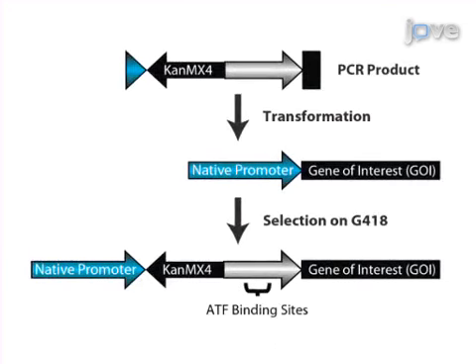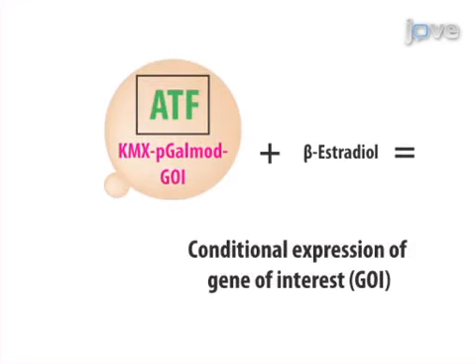The final step of the procedure is to use the validated ATF to conditionally express a native genomic target. Ultimately, any target gene of interest can be made conditionally active.